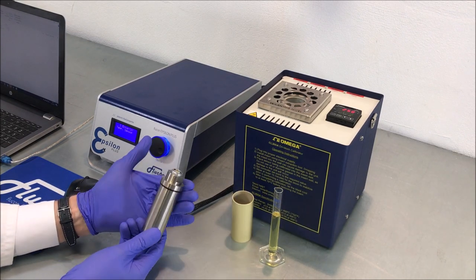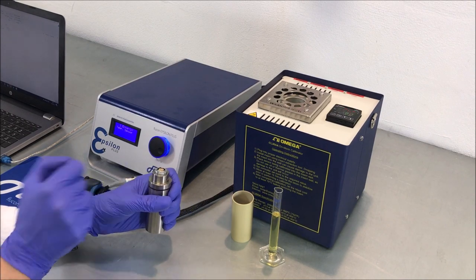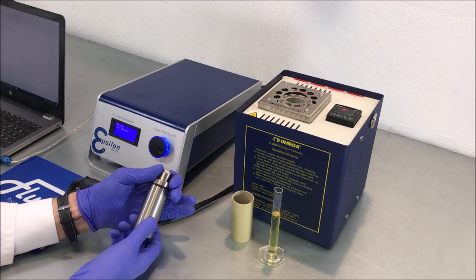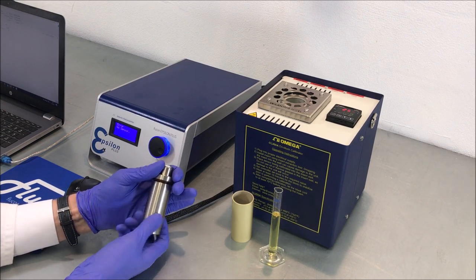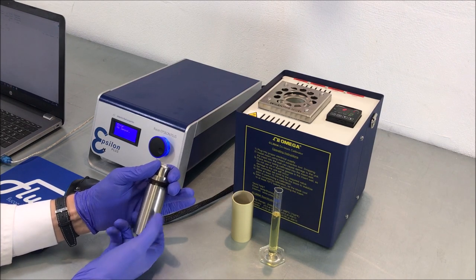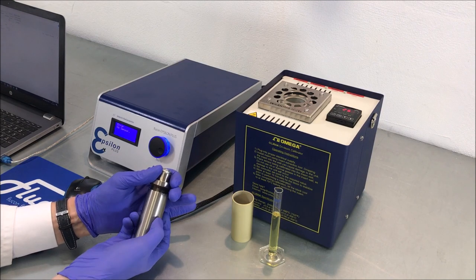Next, you can unscrew the sample cup which also functions as the outer electrode from the sensor head. Be careful with the last turns of the thread and make sure you hold on to the cup once it's loose.